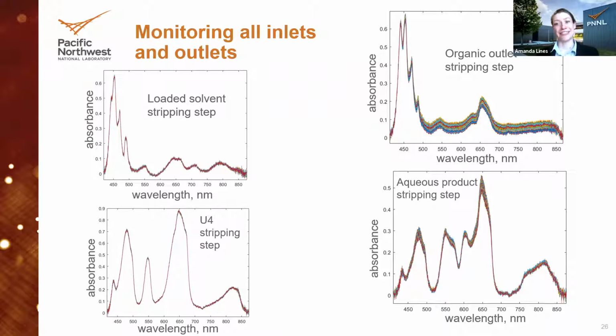So it depends. There are folks who get very excited about their models and they'll optimize their model just for a training set. Usually what that means is they'll put just a ton of principal components in their model. And then that model is beautiful for their training set. But because it's so prescribed to that singular training set, anytime you throw something new or different at it, it's just unprepared. There's too many principal components that it's trying to work towards, and it can't deal with more complex data, more interferences or baseline impacts.